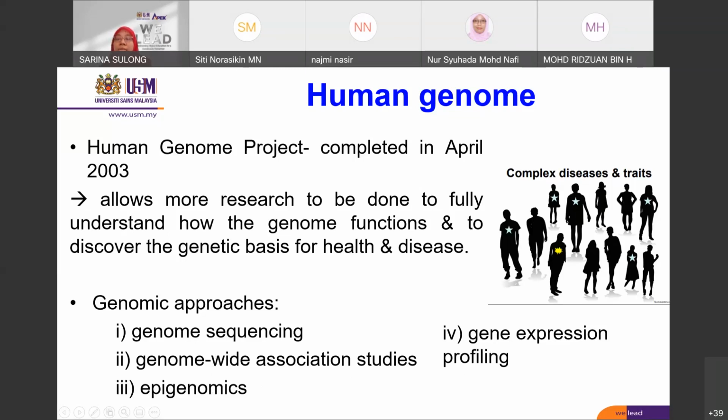It has been reported that genome-wide association studies, or GWAS, became feasible and made a major contribution to understanding the genetics of complex traits and also diseases better. So of course, we can use microarray to do the GWAS studies.